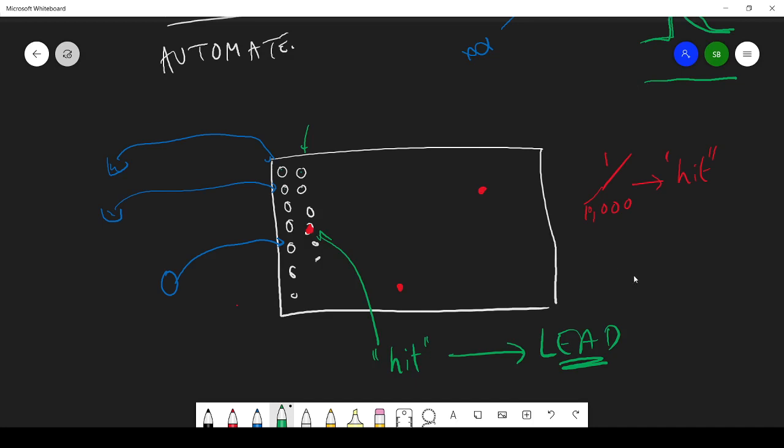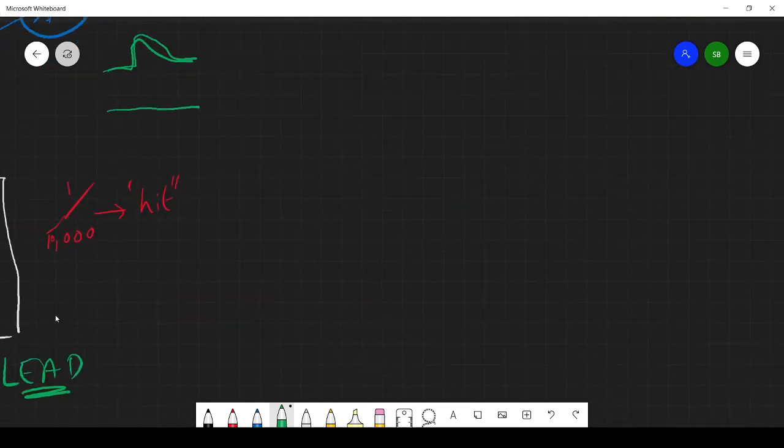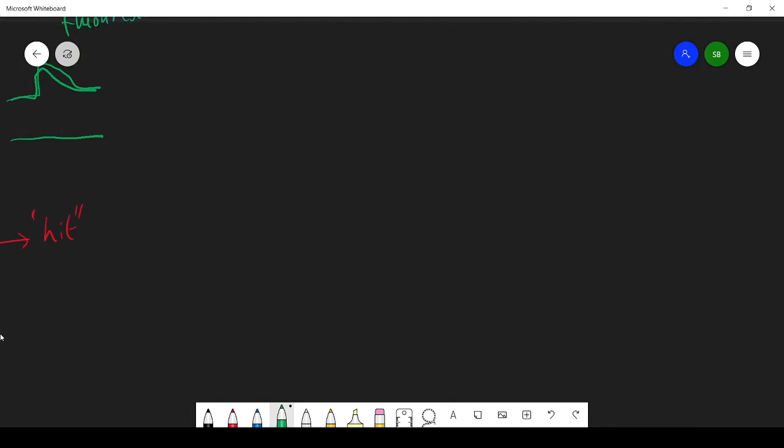So there are many, many ways you can create a screen. The most obvious one is to have it so that when the chemical activates a receptor, you get some sort of response, and that has maybe a fluorescent readout, or maybe it might bind to another chemical to produce a colour.